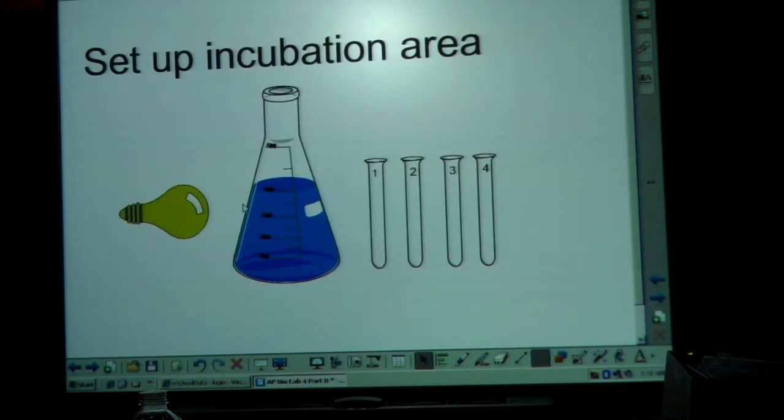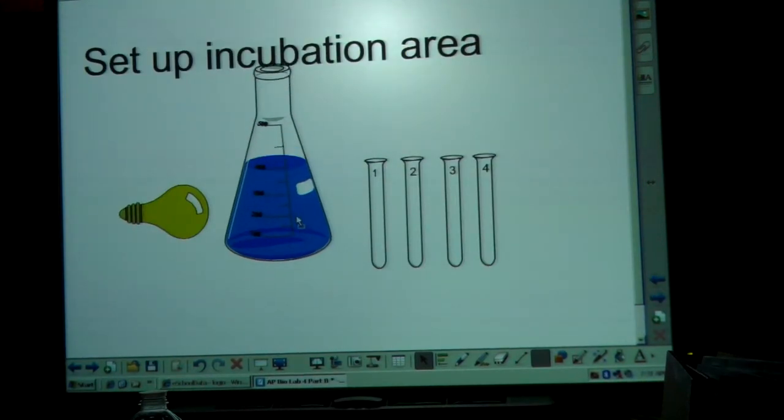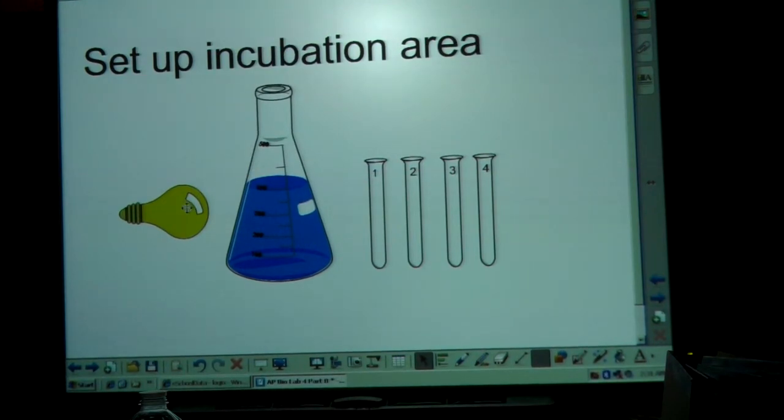Then you set up your incubation area where you have a light source, you have a beaker of water that's going to serve as your heat sink, which will allow light to get through but not any heat. And then you have your four test tubes and some kind of test tube rack. You want to number those one, two, three, four at the very top. You can also use cuvettes if you have cuvettes, though those tend to be quite a bit more expensive.